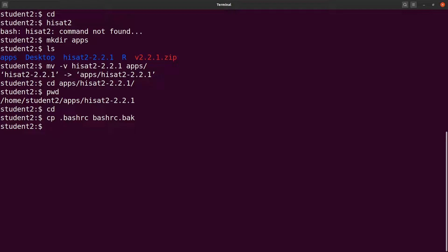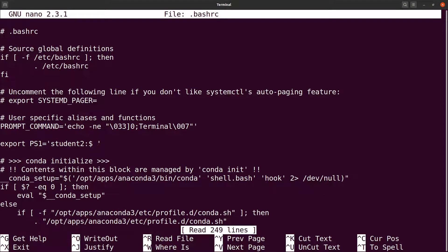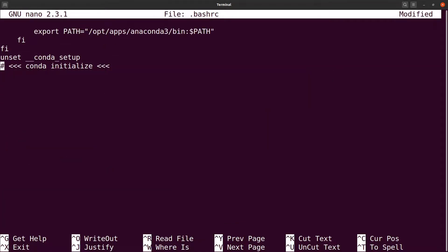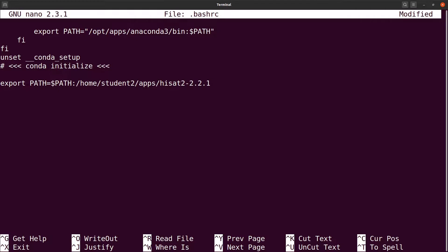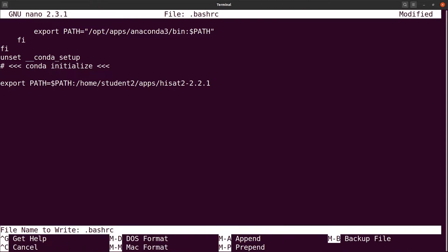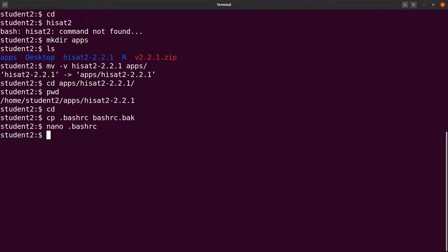I'll now edit the .bashrc file. I'll use nano, but you can also use vi or any text editor. I'll say nano .bashrc. I'll scroll down. And then I'll add a path. I'll say export path and I'll add a colon and then I'll specify the path of the binaries. This is it. And then I'll save the changes. I'll exit and then save the changes. Perfect.